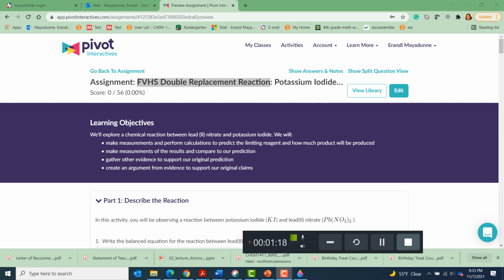So this particular compound, lead(II) nitrate, shows you lead has the valency or the charge of 2 plus. Lead is always a metal. Nitrate is the anion, nitrate is NO3 minus. It has more than one atom, so it is a polyatomic anion. So, the lead nitrate and potassium iodide.